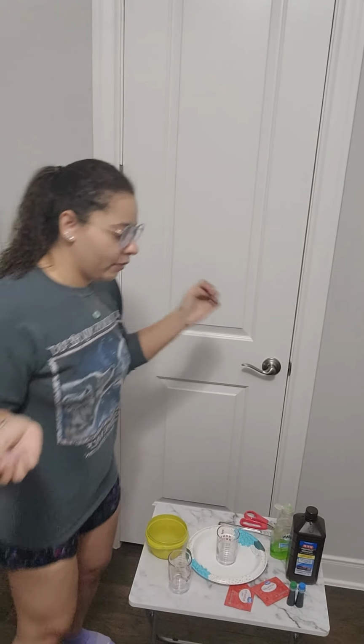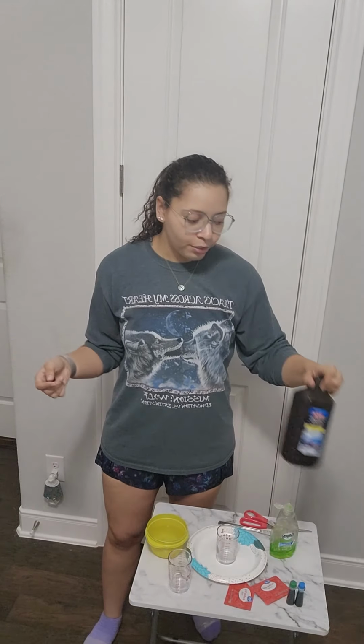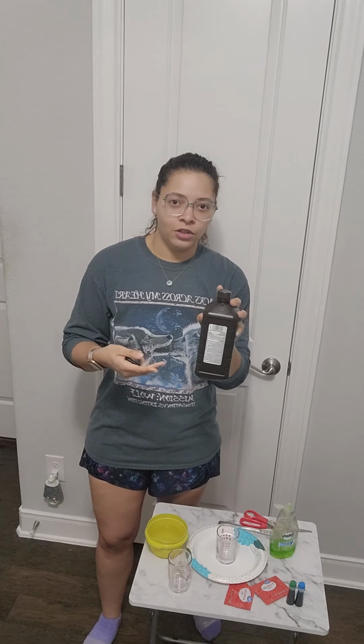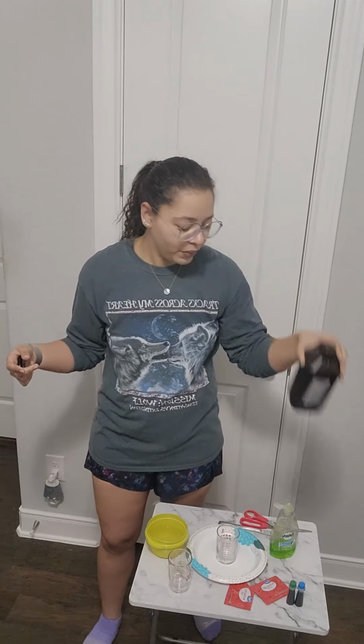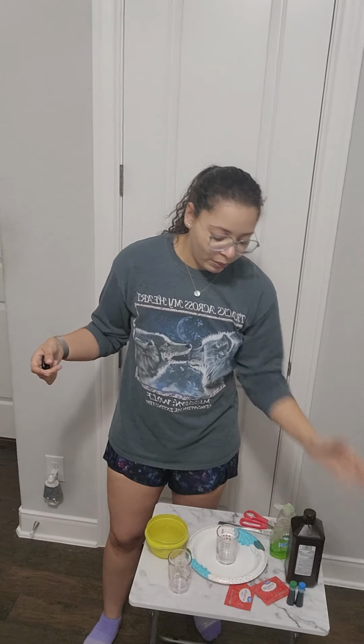In today's experiment, as a premise, hydrogen peroxide is kept in a dark container to keep it from decomposing. Hydrogen peroxide will naturally decompose into H2O and oxygen, which is O2. So we keep it in this dark enclosed container to keep it from decomposing. But naturally, once you let it out into open air and light, it'll start decomposing on its own. However, this is a fairly slow process.